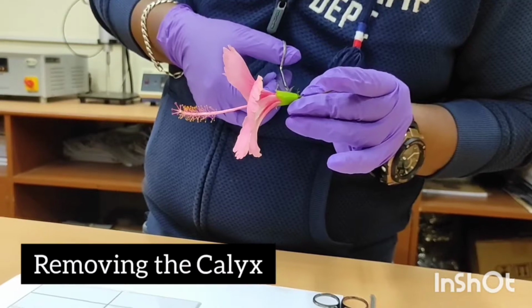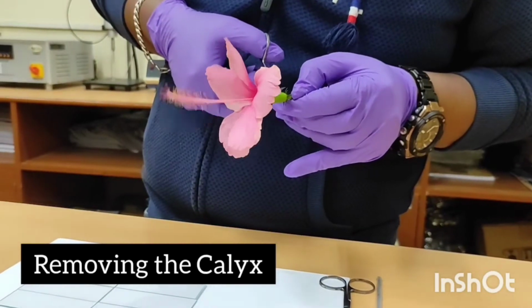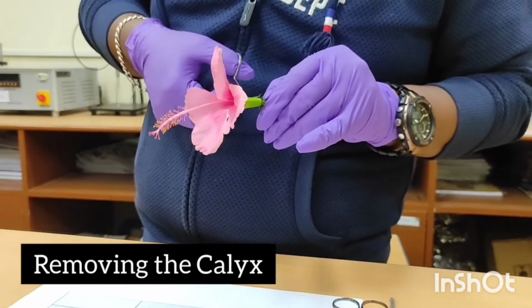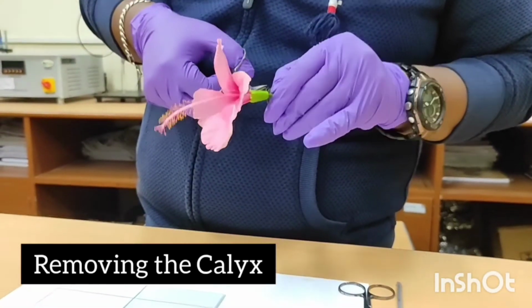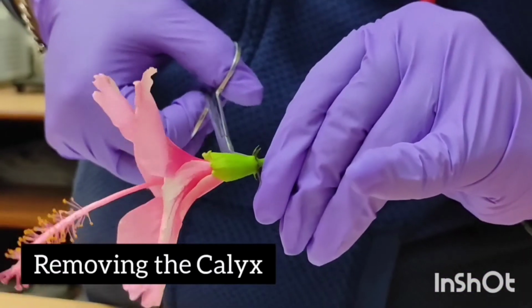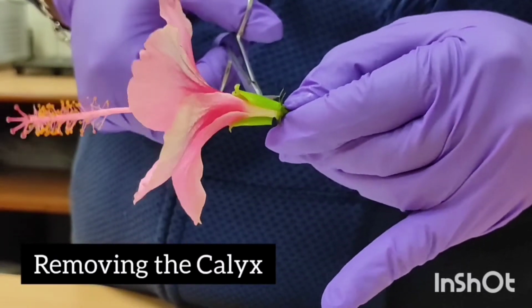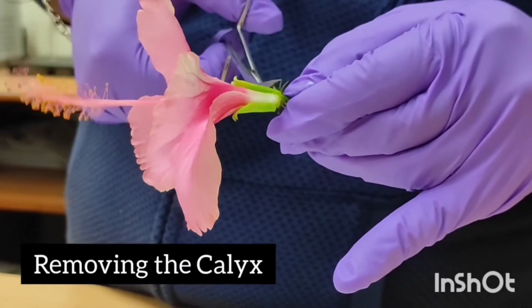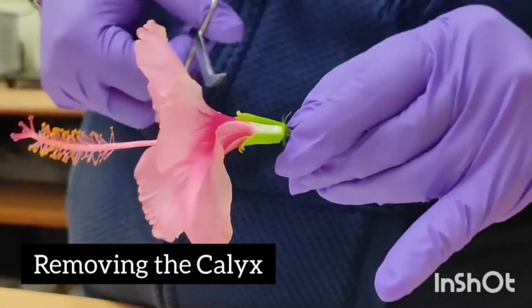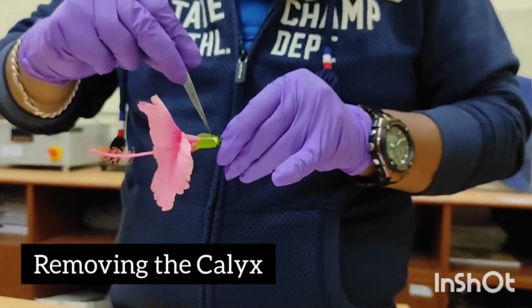You can see here I am removing the calyx part using a scissor. The sepals are united in this case, so we can call this flower as gamosepalous flower. You can see, students, all the four whorls are present in this flower: the calyx, corolla, androecium and gynoecium. So this is a complete flower as well as bisexual.